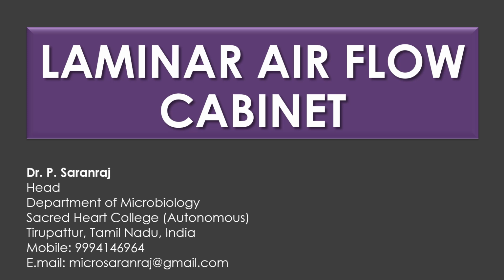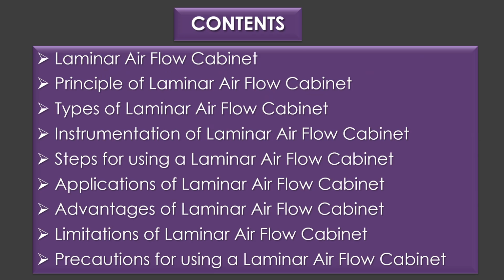Dear viewers, greetings. In this video, we are going to see about laminar airflow cabinet. The contents of this video include an introduction about laminar airflow cabinet, followed by principle, types, instrumentation, steps, applications, advantages, limitations, and precautions for using laminar airflow cabinet.